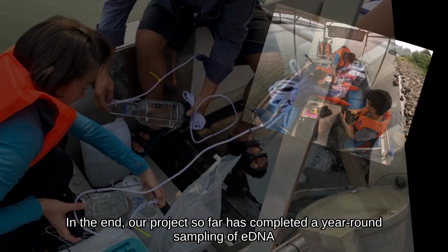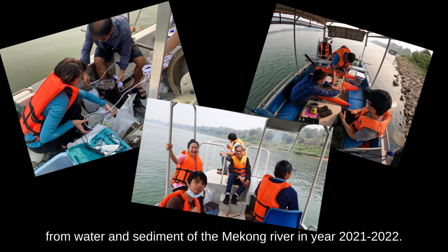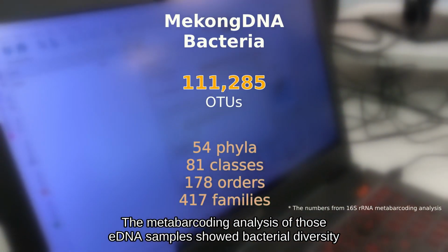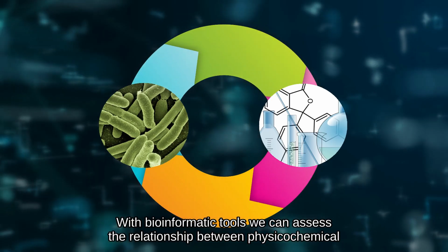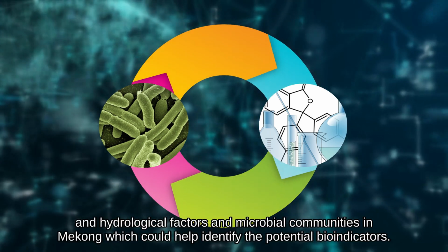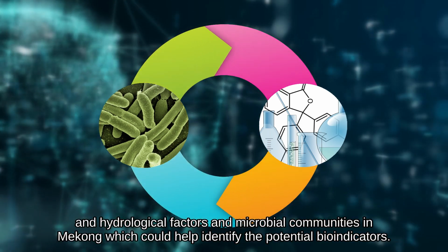In the end, our project so far has completed a year-round sampling of eDNA from water and sediment of the Mekong River in year 2021 to 2022. The metabarcoding analysis of those eDNA samples showed bacterial diversity in the Mekong River, which comprised over 100,000 OTUs of bacteria. With bioinformatic tools, we can assess the relationship between physicochemical and hydrological factors and microbial communities in Mekong, which could help identify the potential bioindicators.